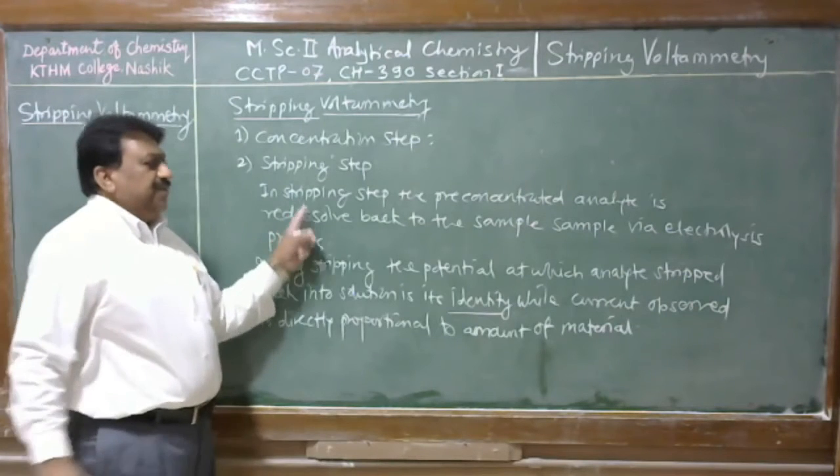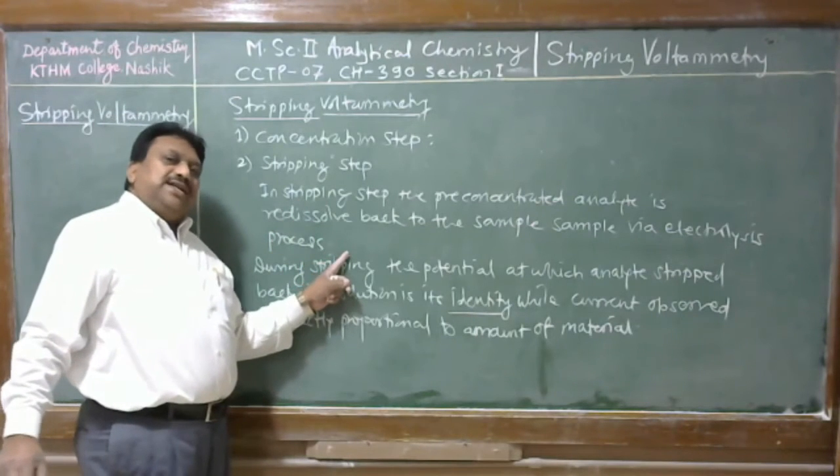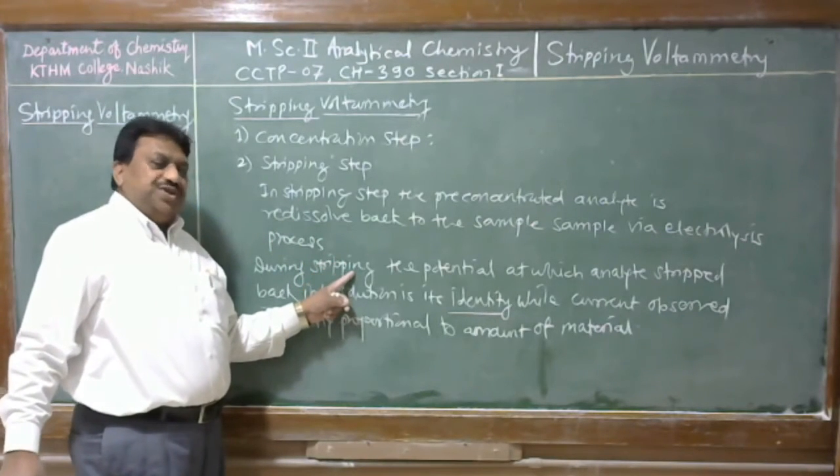Therefore, here analyte is redissolved back to the analyte solution.